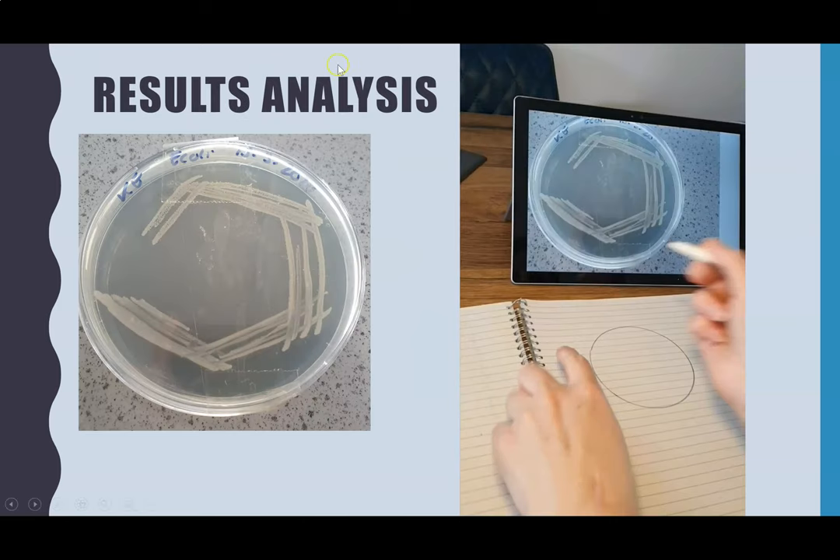When it comes to results with the streak plate, what you're looking for is whether you got any individual colonies — these tiny circles. You might have had bigger circles; if you did, well done, because that's what you were aiming to achieve. The whole point of streak plating is that you only dip the inoculating loop into the bacteria once, then spread it across the plate — dragging across a first spread, then a third, fourth, even a fifth — each time spreading the bacteria thinner so you can eventually identify individual colonies.